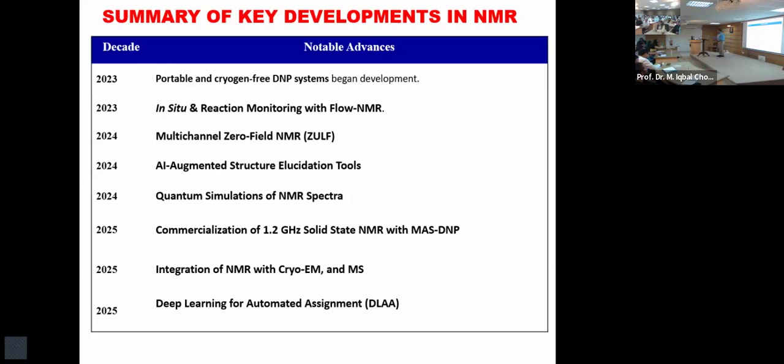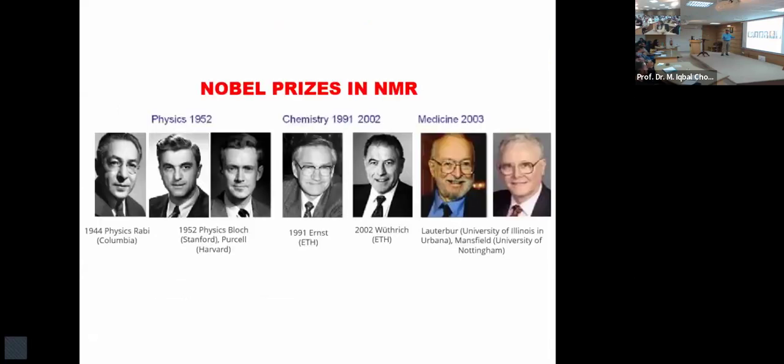Sensitivity problem. And that is the main driving force in NMR spectroscopy, apart from interpretation, which is the basis of multi-dimensional NMR spectrum. And these are wonderful, great people.